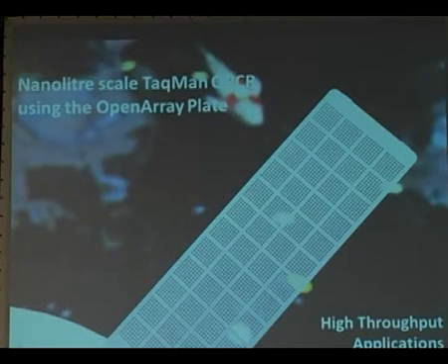And the reason we divide the plate like this is it allows us to achieve a flexible range of assays to samples. In other words, we can screen a small number of assays per sample all the way up to a large number of assays per sample by using or combining various parts of the plate.